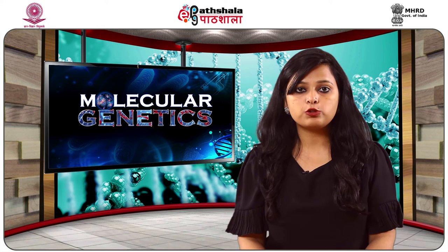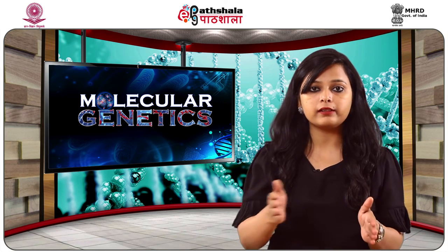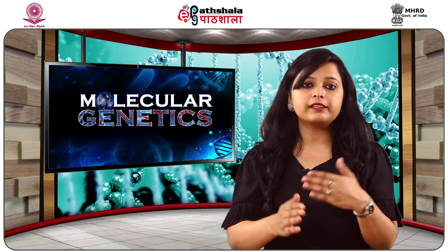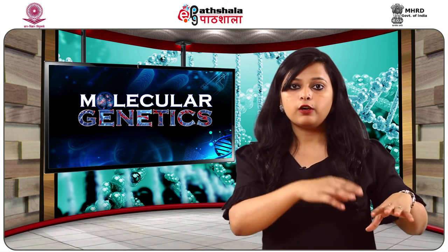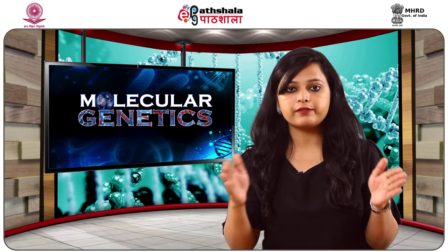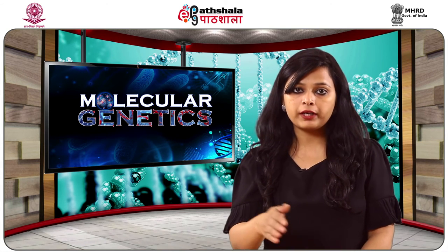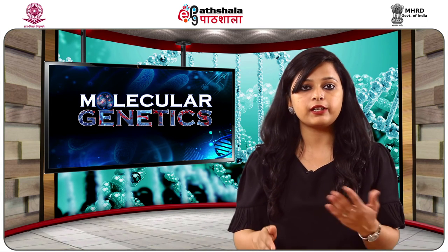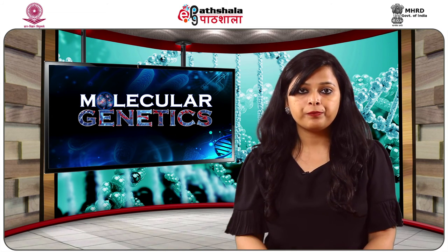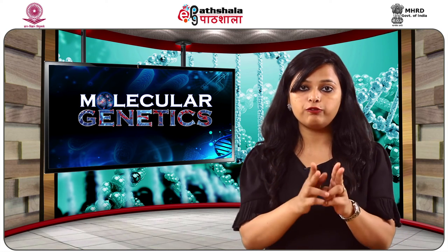Alkali treatment leads to the denaturation of double-stranded DNA to single-stranded DNA by breaking the hydrogen bonds between the strands. This single-stranded DNA form facilitates the transfer and binding of DNA to the membrane, that is the nylon membrane, and ultimately is required for the hybridization process with the probe. Finally, the gel is neutralized by soaking in Tris-salt buffer, since DNA transfer and immobilization on the membrane occur at neutral pH.